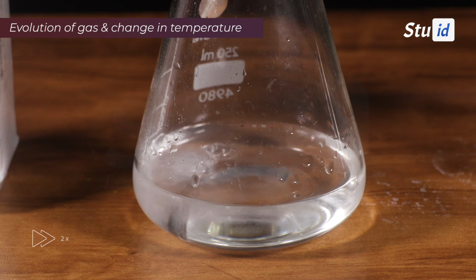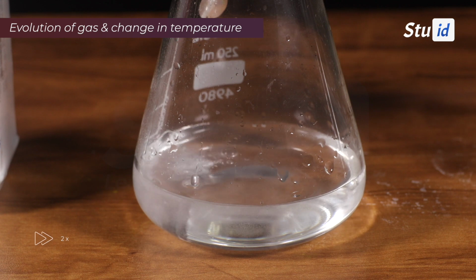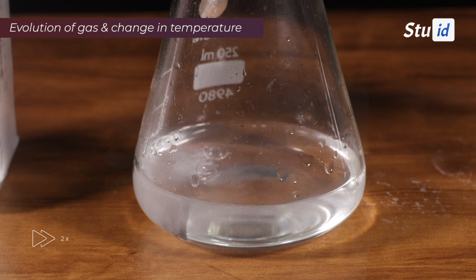You know why these bubbles are evolved? This shows a gas is formed there, which is hydrogen gas. And we know that it is odorless and colorless. So, hydrogen gas along with zinc sulfate is formed there.